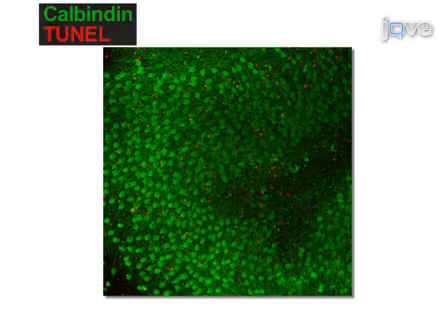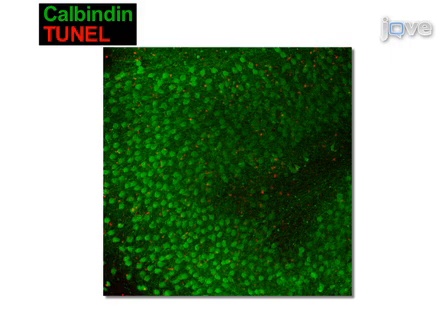The final step of the procedure is to analyze the effect of Fas ligand in the different cerebellar cell populations of wild-type and knockout mice based on immunofluorescent staining for the apoptotic marker TUNEL, combined with cell-type specific markers like calbindin for Purkinje cells.